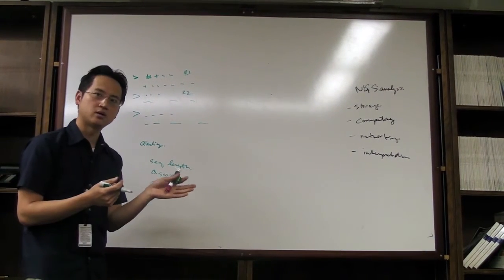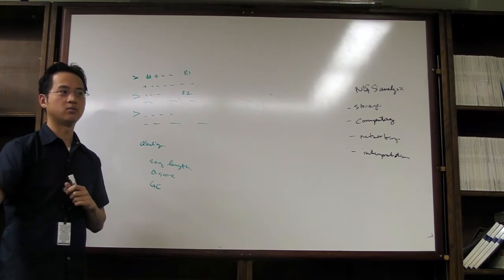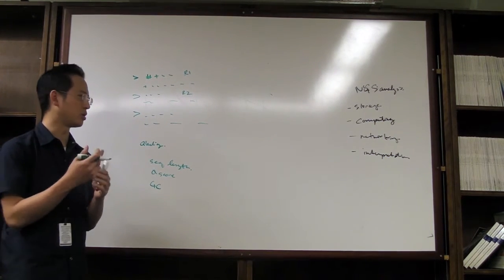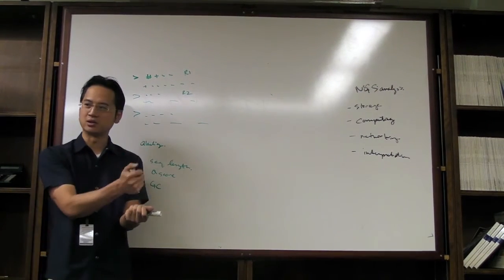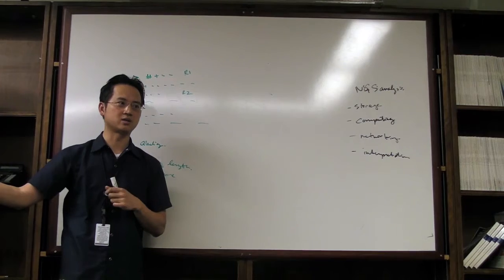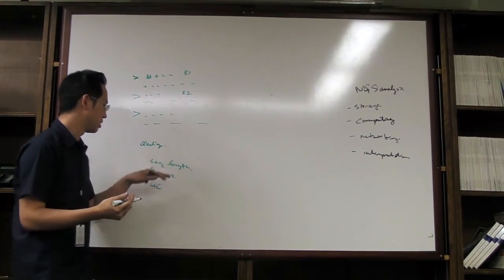A run on the HiSeq today might be completely different from a run on the same machine tomorrow, right? Depending on who's operating it, what reagent lot you use. Same thing with Ion Torrent. The run, someone who loaded it today versus someone who loaded it the next day, and whether it's a 100 base pair kit versus a 200 base pair kit, you can get different quality.